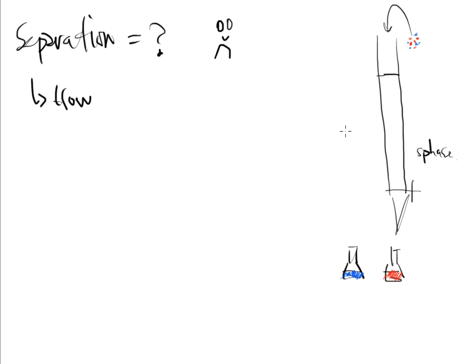What steps are taking place inside of that column to actually allow the column to provide the separation for us? Well, here's the thing. What we've decided to do is to make something up. That sounds good, doesn't it? We make something up that pretty much fits. And then we tell it to you, and we learn chromatography this way, and we never really question it after that point.